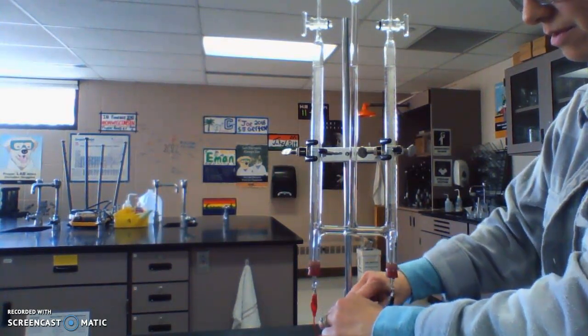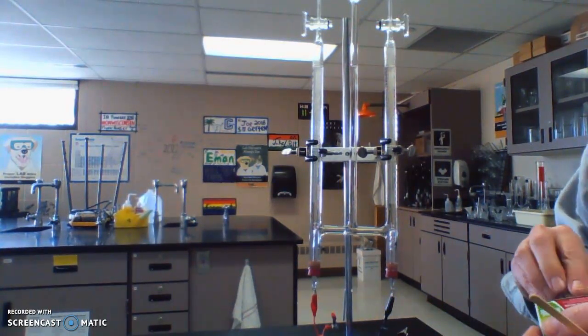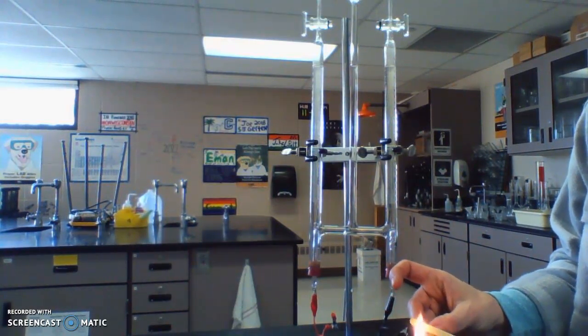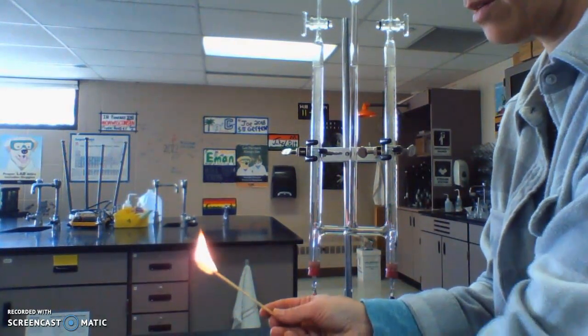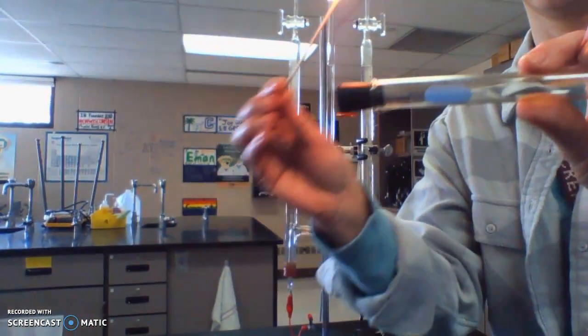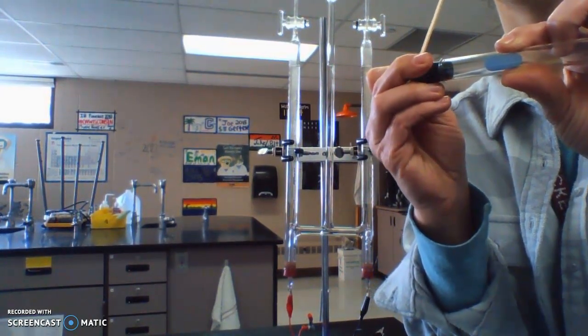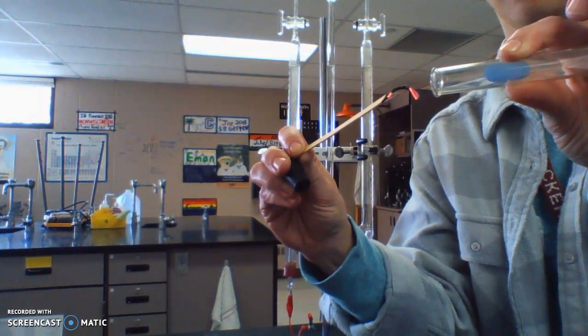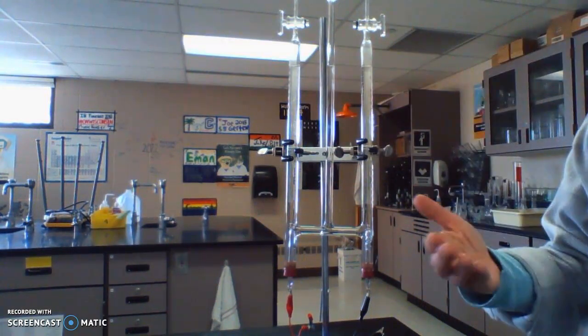For oxygen we're going to use what's called a glowing splint, because fire needs oxygen. We're going to see if a splint that has been blown out so it's just glowing will either glow brighter or possibly even reignite. I'm going to blow this out and then put it in the tube. There, it actually glowed brighter right there when I first put it in the oxygen. That is a positive test for oxygen.